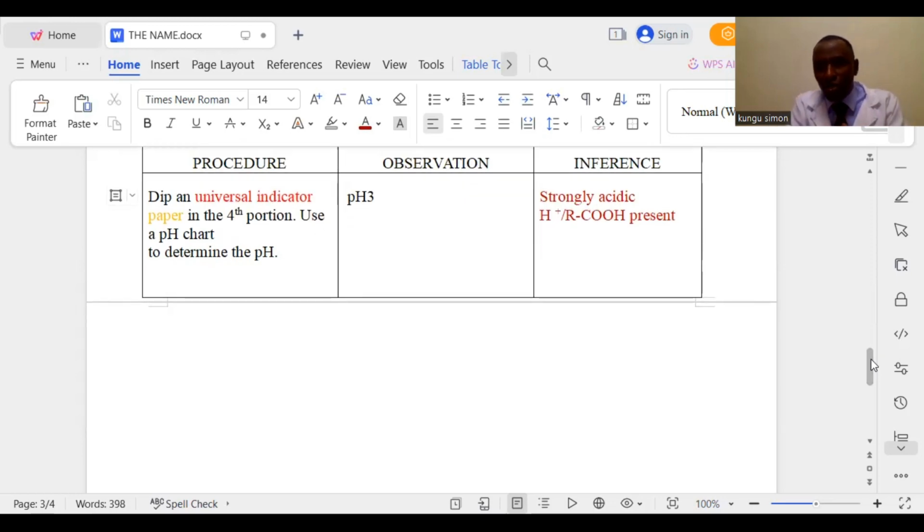In other words, the compound that I was dealing with, one, it was an acid. It could have been an organic acid. Now, this organic acid here was unsaturated. Please, we can have all these functions. We can have 2 functional groups in a given compound. It can be an acid that is unsaturated.